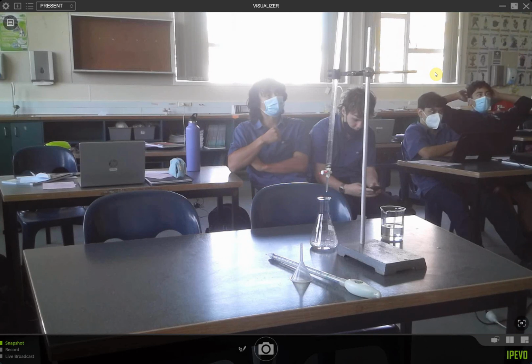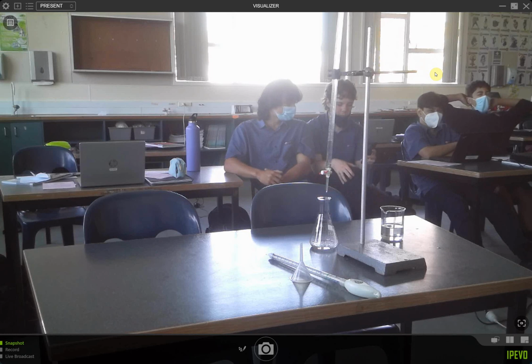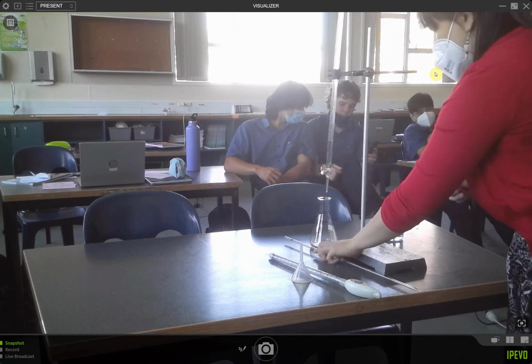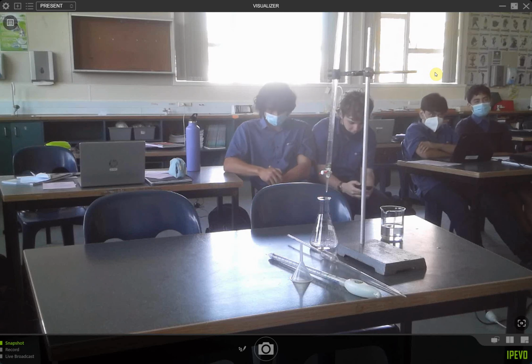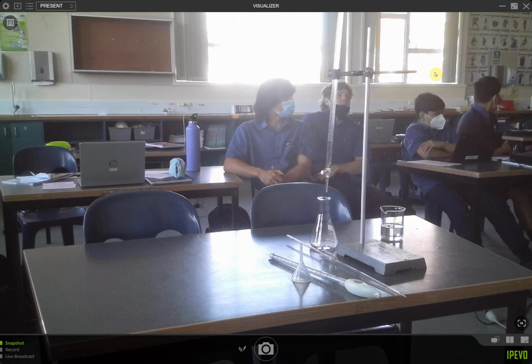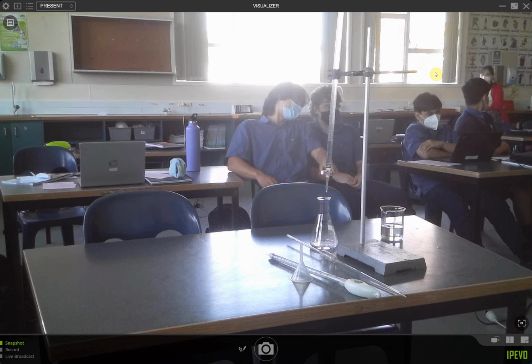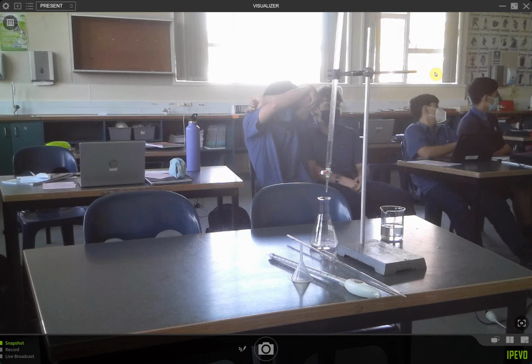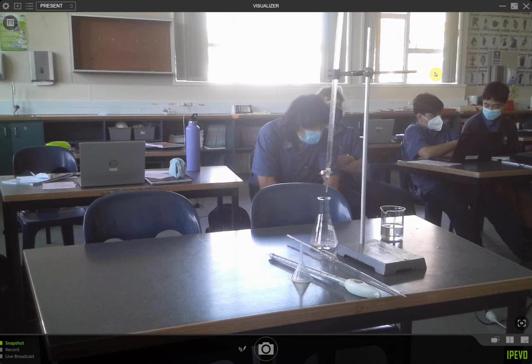I have mostly used this one in high school. This one here is only 25, and you're going to be filling it to the line. Some people might find that easier. When you are doing that, you have these things called bulbs, and there are lots of different versions of bulbs. This is my own personal preference, but there are two other ones you can get. I'll grab them so you guys can see. Yeah, there are lots of them. There's this one here. I'll show them on camera.